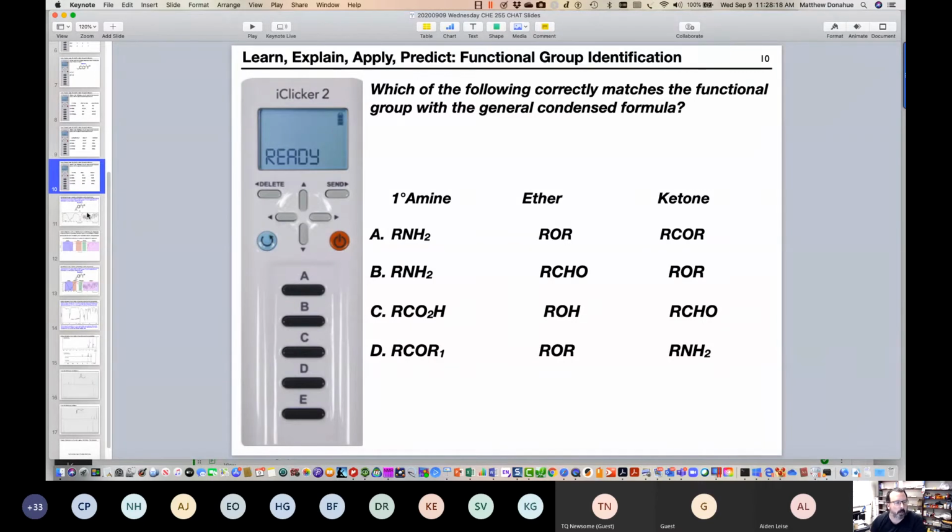So I want to basically transition now into infrared spectroscopy. And again, this is going to be a very practical introduction to it. I'll have the more formal lecture screencast posted today or tomorrow. I'm creating new slides for each functional group to show you not only the static spectrum, but also a short movie that shows you the actual bonds involved.